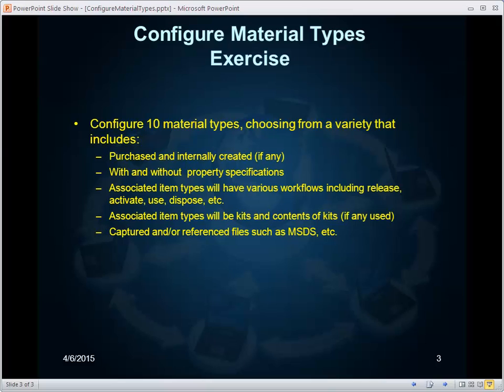If you have any questions in the course of this exercise, call the Blaze LIMS hotline or communicate via email. Once you are finished, call the Blaze LIMS hotline for review of the mechanisms, naming, and so forth that you used in configuring these material types.